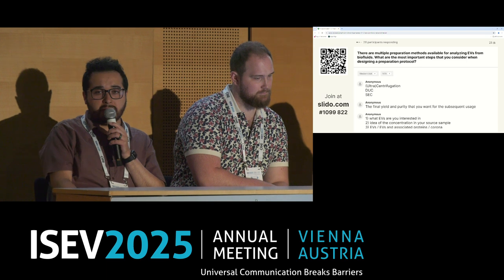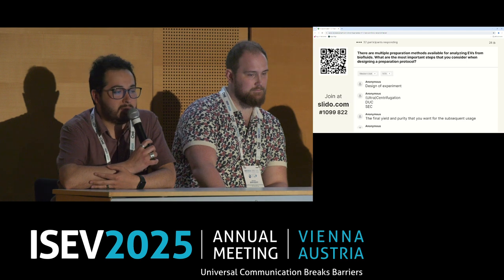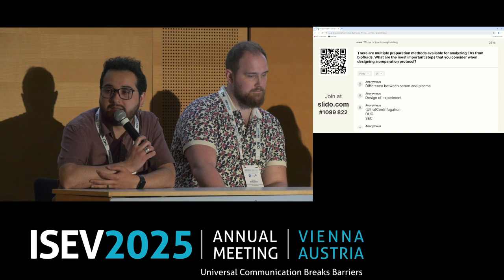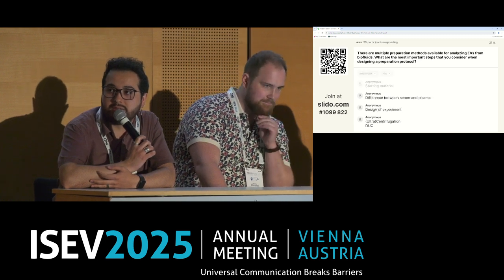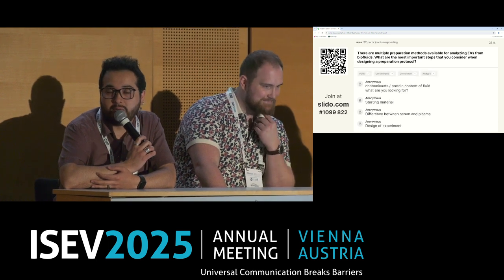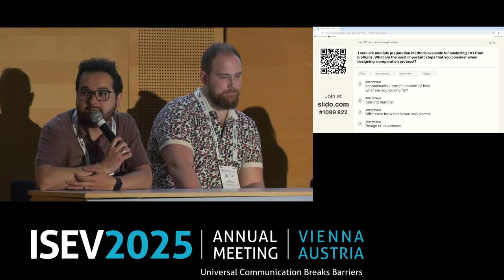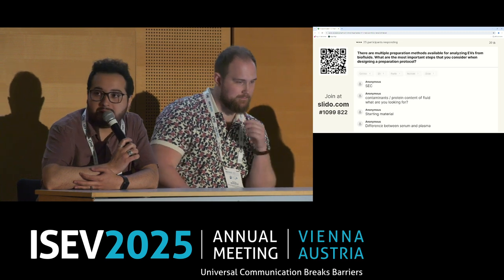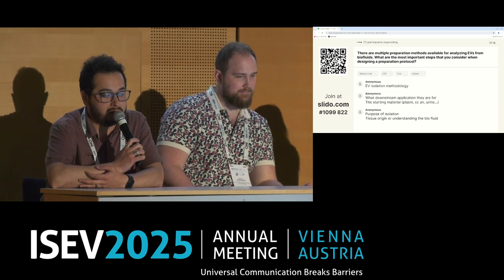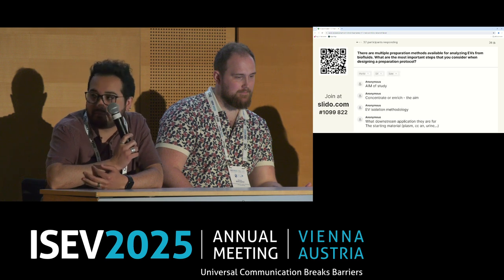And yeah, to preserve, you need to consider that your sample will be frozen at some moment, and the thawing will affect the samples. Try not to freeze and thaw many, many times. And in my hands, I always prefer to do all the analysis possible from the same samples. So analyze the EV particles or quantify what is inside, and then use the same sample for Western blot analysis, etc.